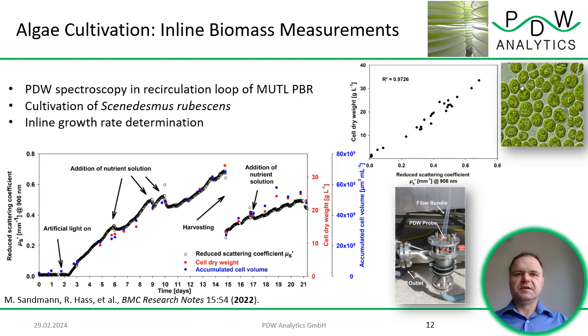What has also been done is the application of PDW spectroscopy in algae cultivation, here mainly for inline biomass measurements. This has been a so-called mesh ultra-thin layer photobioreactor, and here PDW spectroscopy was implemented in a recirculation loop. Here Scenedesmus rubescens was cultivated over a longer period of like 20 days.